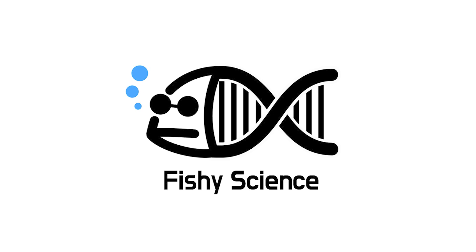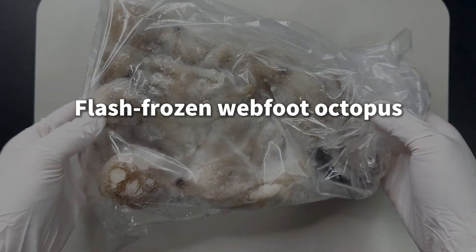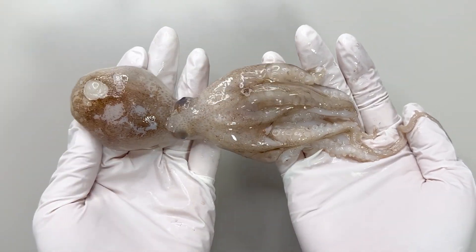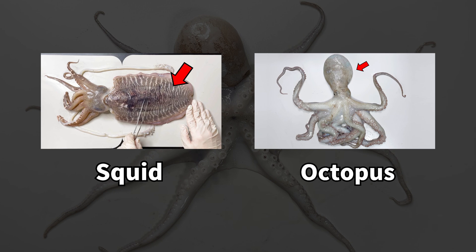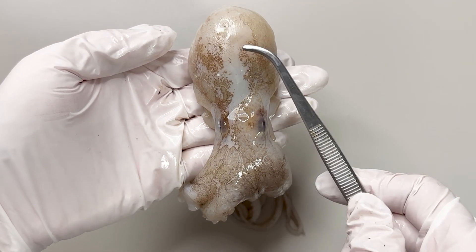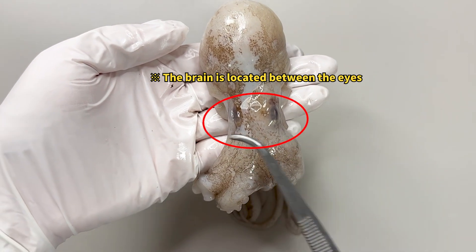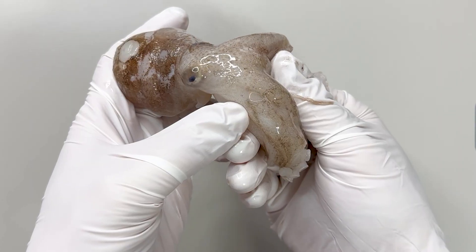Today let's dissect a webfoot octopus for observation. We've prepared a frozen one — after thawing it, ta-da, its body is still perfectly intact. By the way, we always point this out when introducing cephalopods: this upper part is actually the body, not the head.